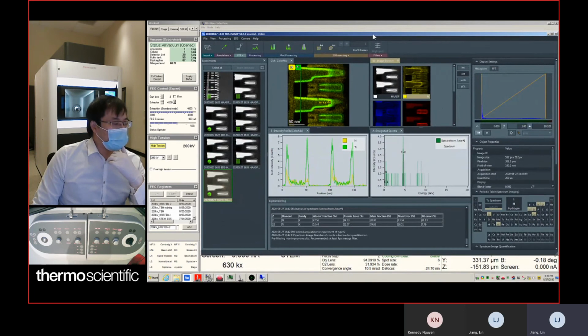If no questions, I'm going to wrap up, because that's pretty much how we do EDS quantification and application. Today we reviewed the EDS concepts and how we do EDS visualization and quantification. I also did a live demonstration of how we acquire EDS data at different magnifications. At higher magnification, we might want to use a small current.